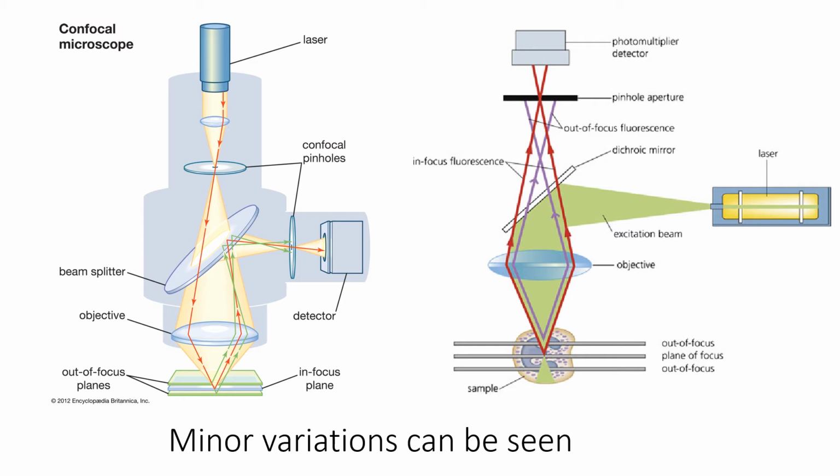Let's now talk about the parts again, but in the form of a picture. As I said, there's a laser source which helps us get UV light rays in a monochromatic way, which is a single wavelength. So this is producing light rays and we only want single wavelength light rays to hit our object, to hit our specimen. So what are we doing?